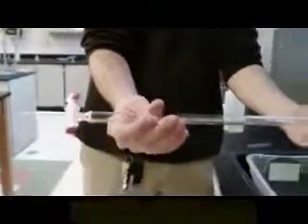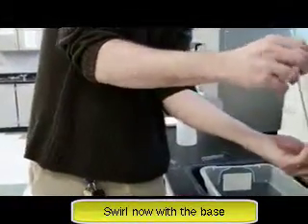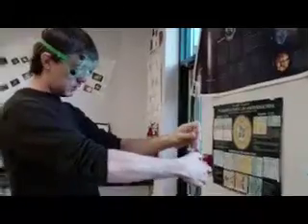So I've got a little bit left in there. I'm going to do the little spinny thing again. This will get any drops that are on the inside of the burette rinsed out of water and replaced with potassium hydroxide. Okay, so now it's rinsed and ready to go. It doesn't take too long to do that, but you need to do that every time you start a titration. All right, so we're just going to put this on here.